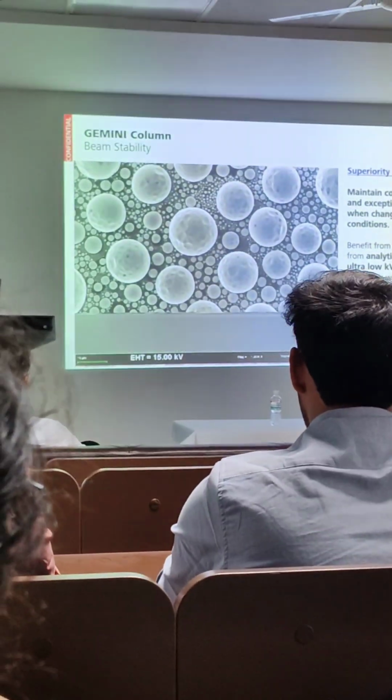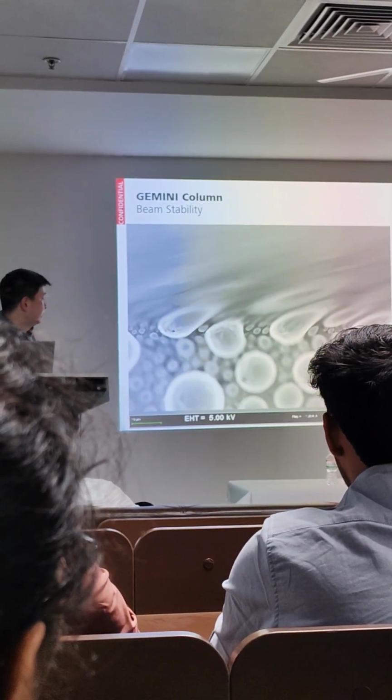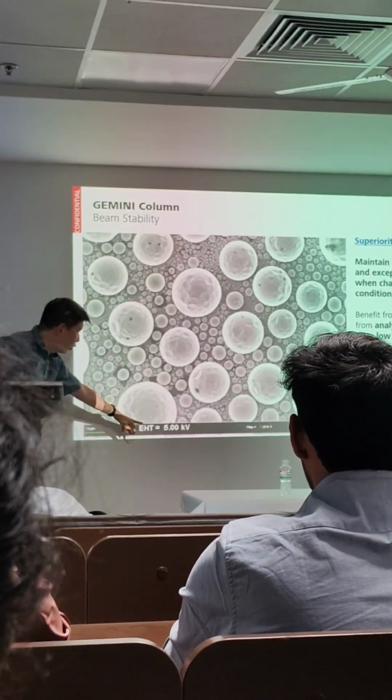We are at the 15 kilovolt, right? You keep looking at this. Now we lower it down to 10, to 5. No alignment. Just one scan, they come back, right? You will see. We will lower down again.